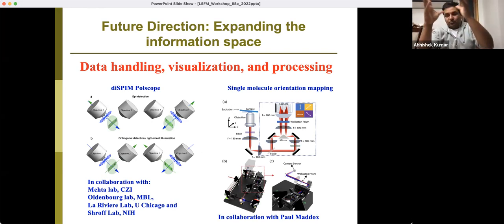If you plot on a sphere, you'll see that depending on how molecules are oriented, there are a lot of degeneracies. And a SPIM system is ideal because you can capture from different directions to break some of those degeneracies. We have successfully implemented it, but there are still a lot of challenges in retrieving that orientational information and in data fusion, which we are working on.